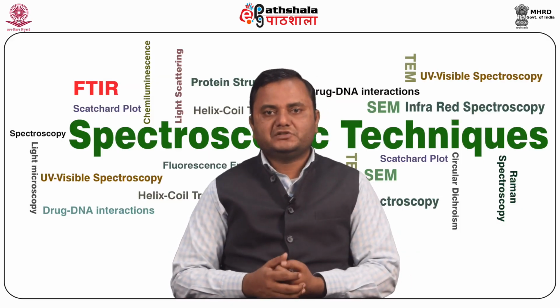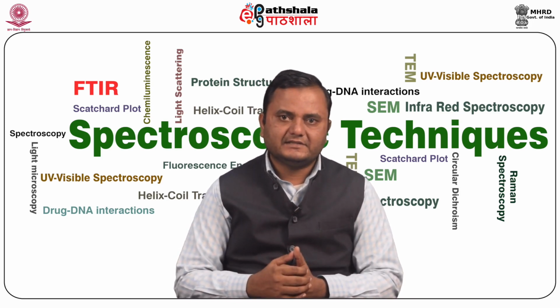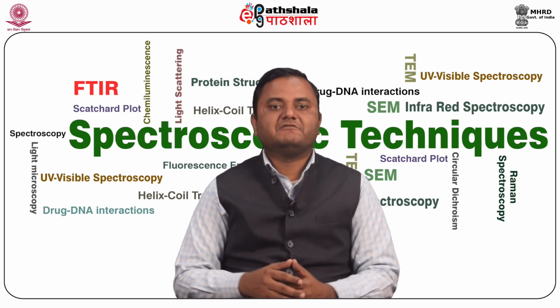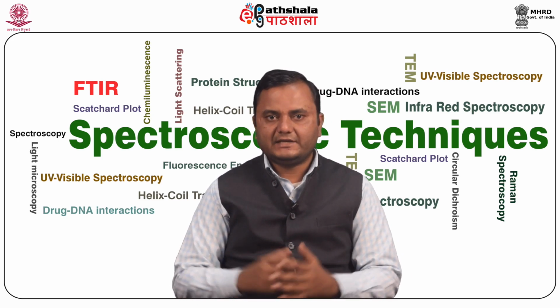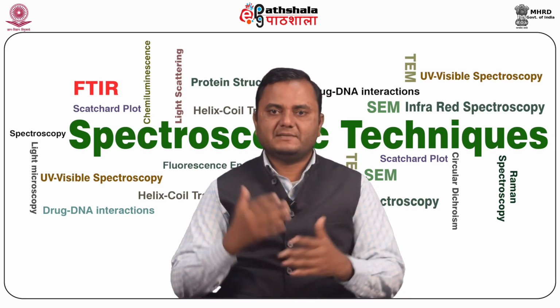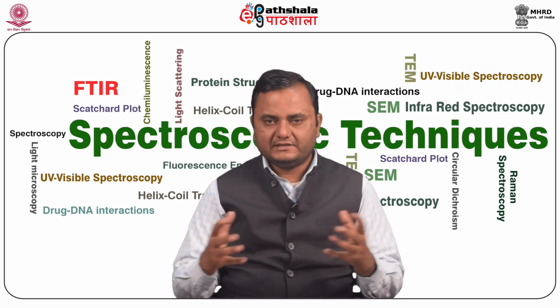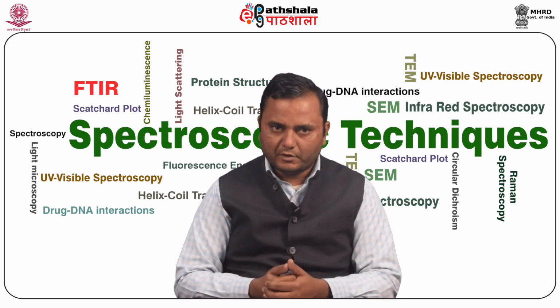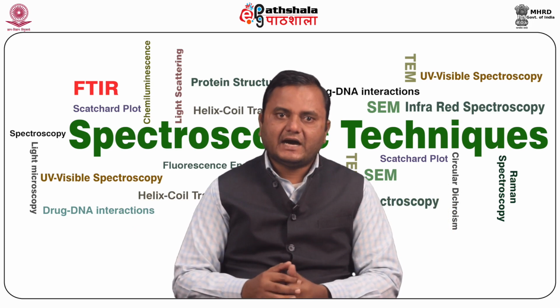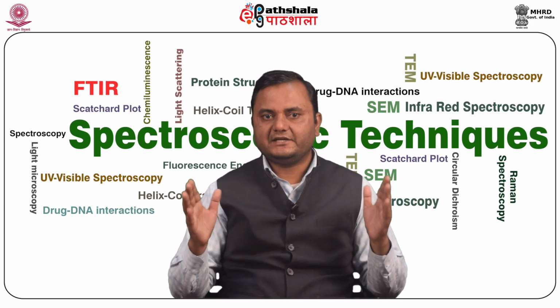Now we talk about the key functional groups by region of the IR spectrum. The energy of a photon in the IR region corresponds to the difference in vibrational energy levels within the molecule. The vibrational energy levels depend on the types of bond and bond strength. As I discussed already, the type of bond means double, triple or single bond, and of course the bond number decides the strength of the bond, and it also depends upon the groups attached to them. IR is highly useful to determine if a certain type of bond or functional group is present in a molecule.